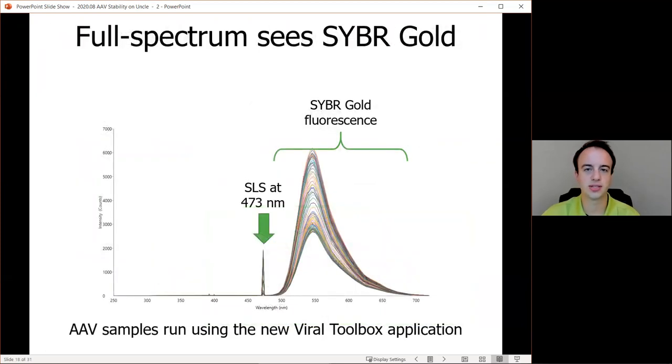So here's a look at the raw fluorescence data seen on UNCLE with Sypro Gold. This is the same concentration of AAV9 that we saw earlier, but this time we've added Sypro Gold and we're using the blue 473 nanometer laser. So in this case, we can see that the dye's fluorescence is in a different part of the spectrum, between about 500 and 650 nanometers. We also see an SLS peak at 473 nanometers. In this experiment, only that blue 473 nanometer laser is used, so that's why there's no intrinsic fluorescence or SLS spectrum at 266. As temperature increases, we'll actually be measuring the area under the curve in this case, and the area under the curve will generally increase.